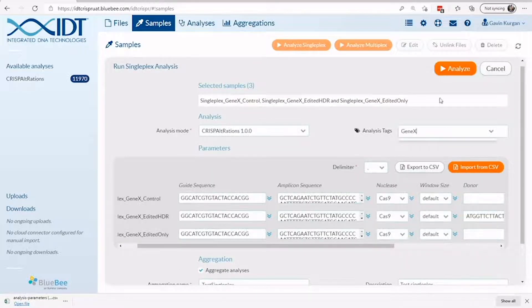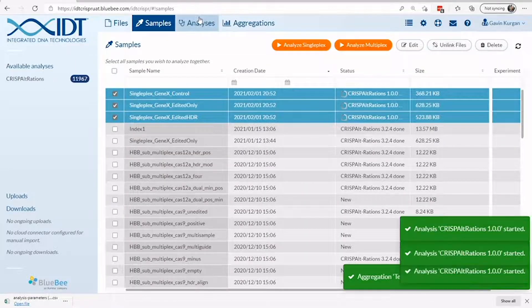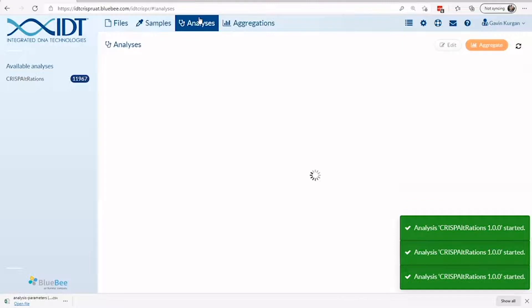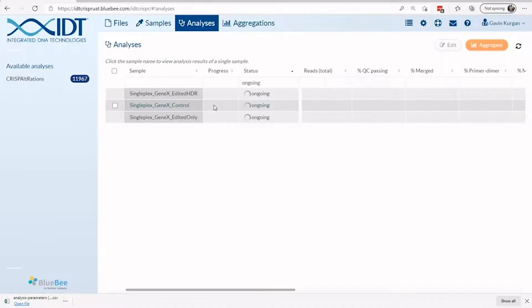To check on the status or results, navigate to the analysis page. As soon as cloud resources are partitioned to begin processing, a progress bar will appear. Analyses run in parallel and will typically take between 20 minutes and 2 hours to complete.